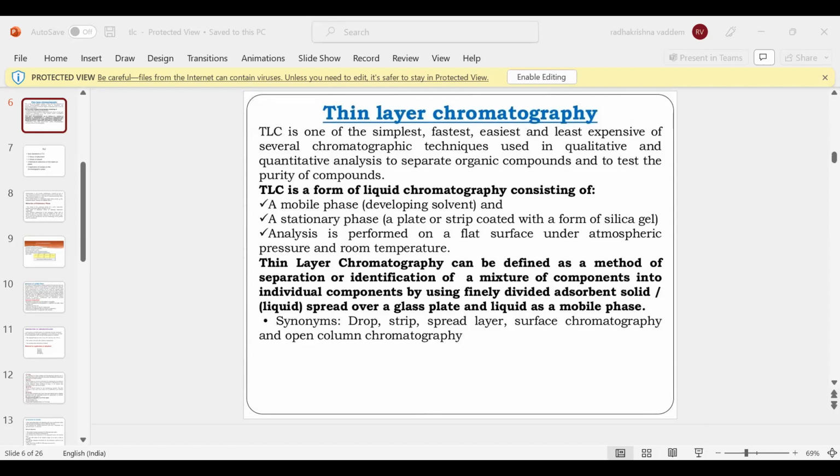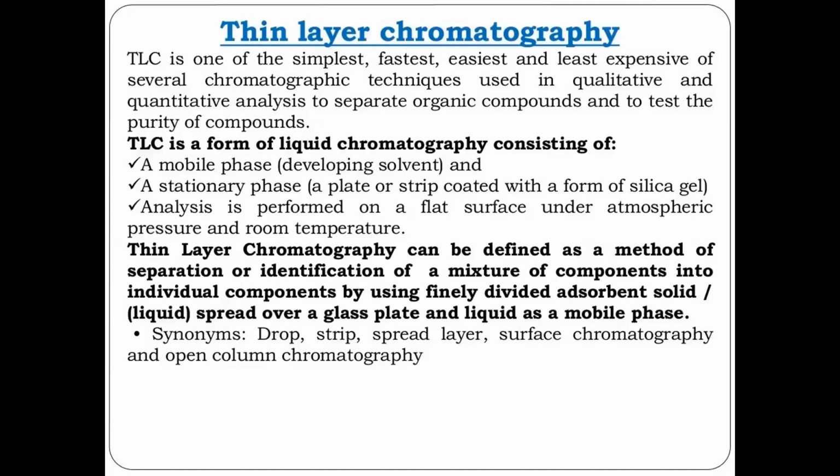It is used for the separation or identification of a mixture of components into individual components by using the stationary phase and mobile phase.